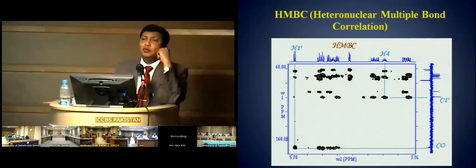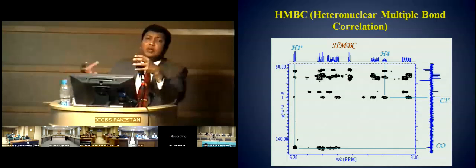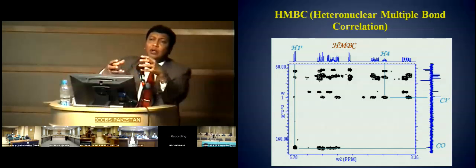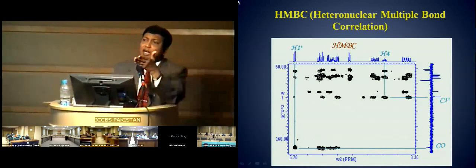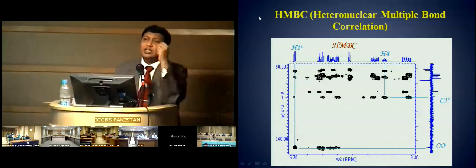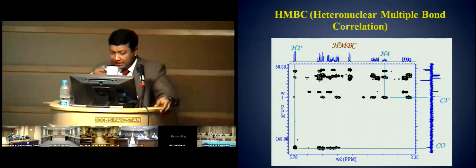It is an amazingly powerful technique: you make structural fragments by using HMQC, COSY, TOCSY, etc., and then you put them together into an overall gross structure by using a long-range coupling between proton and carbon, the proton of one spin system and the carbon of another spin system. This is the most beautiful technique. That's how you put different structural fragments together, one piece after the other.